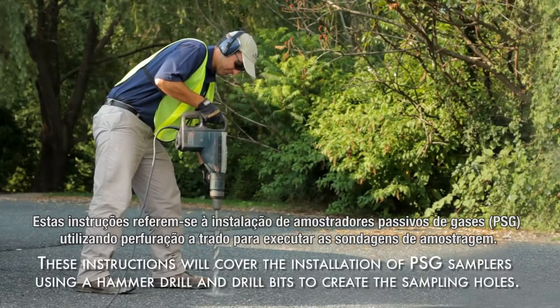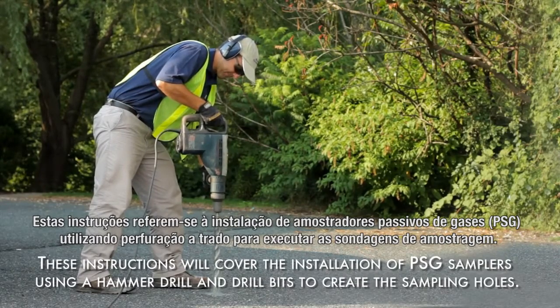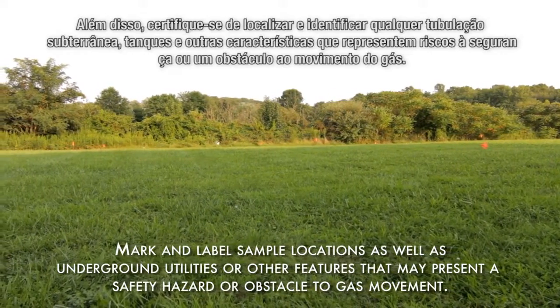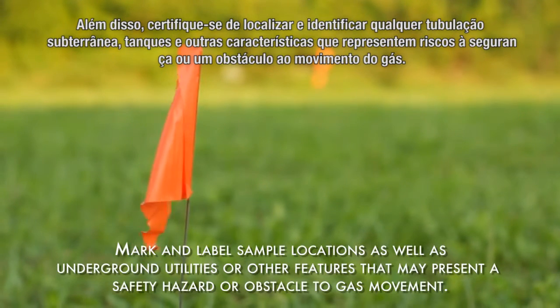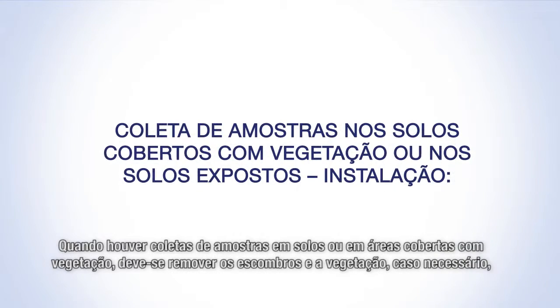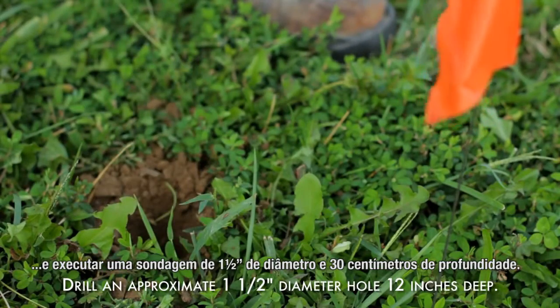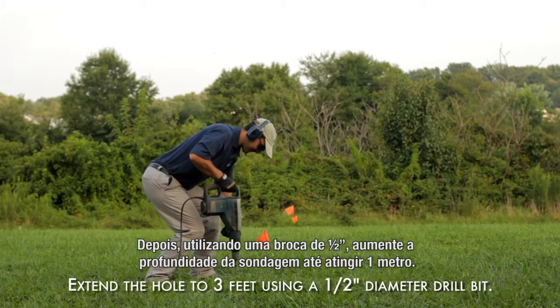These instructions will cover the installation of PSG samplers using a hammer drill and drill bits to create the sampling holes. Prior to beginning sample collection, mark and label the sample locations using pin flags, wooden stakes, and/or spray paint. Also make sure to locate and mark any underground utilities, pipes, tanks, or other features that present either a safety hazard or an obstacle to gas movement. When sampling in soil or vegetation covered areas, clear vegetation and debris as necessary and create an approximately one and a half inch diameter hole 12 inches deep. Then, using a half inch diameter drill bit, extend the hole to a three foot depth.